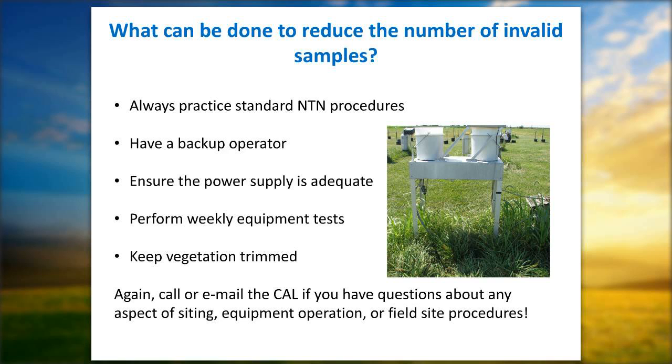Ensure the power supply is adequate, whether you have AC or solar. We normally recommend twice a year, when we winterize and summarize the gauges, that you do a check of your power supply. Going into winter, you want to check your batteries and make sure that they're adequate.